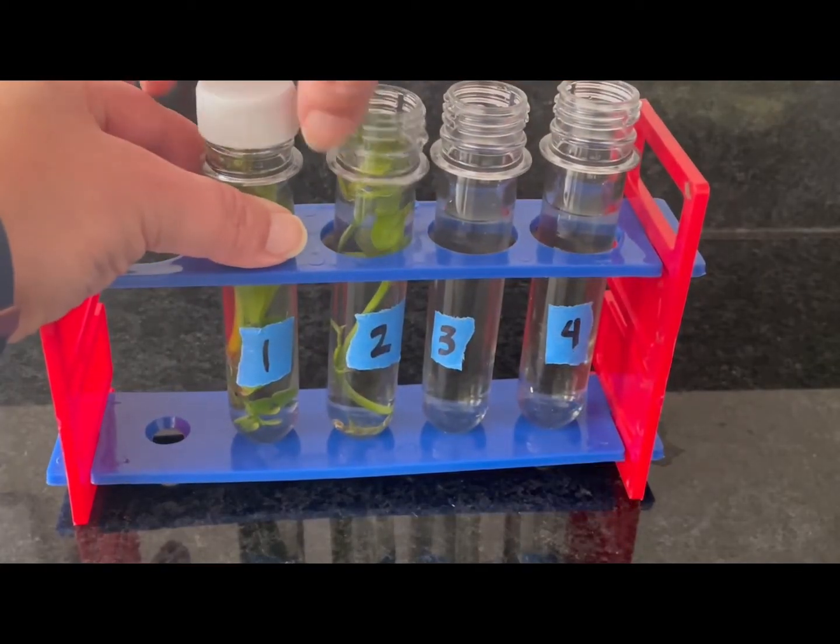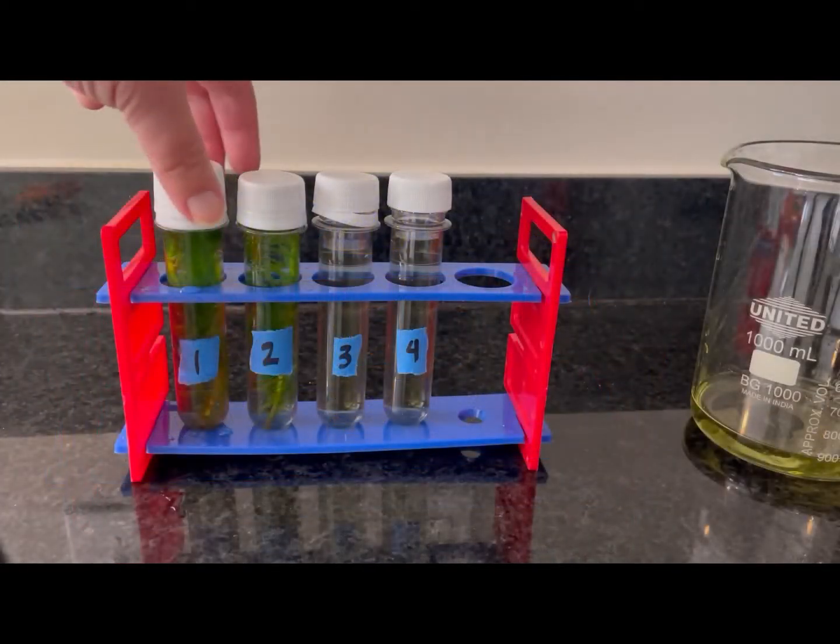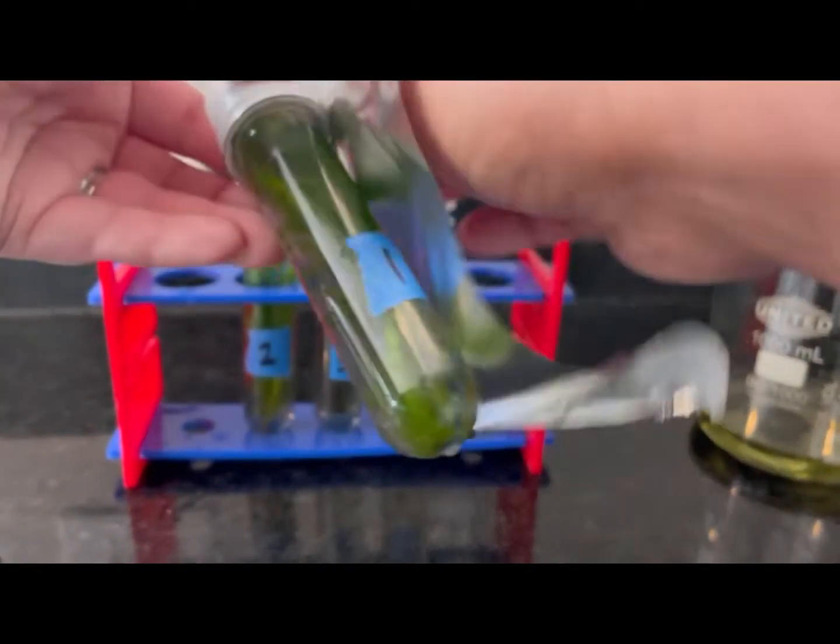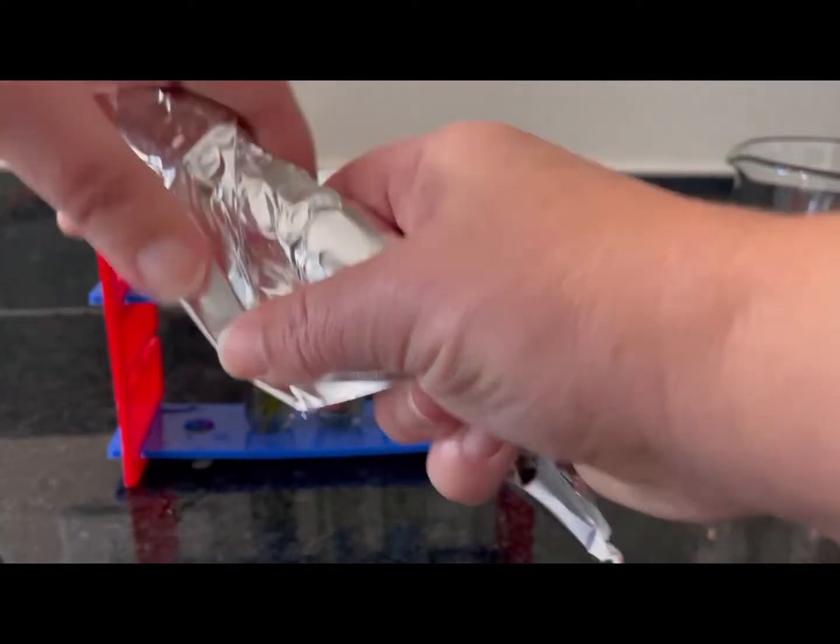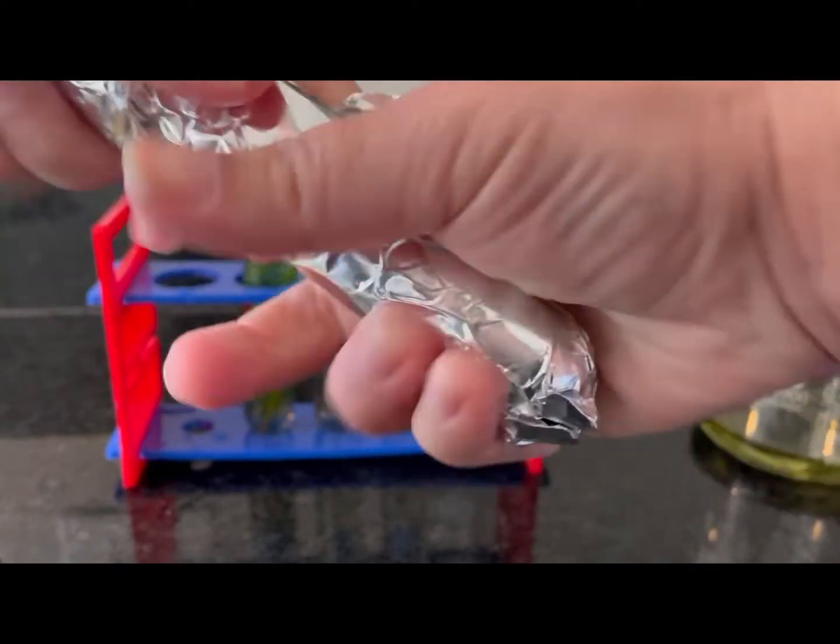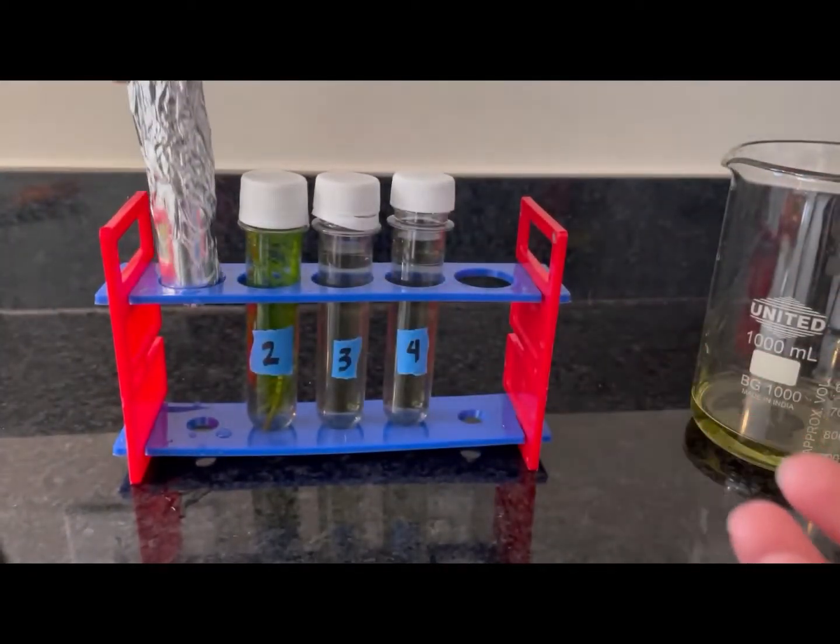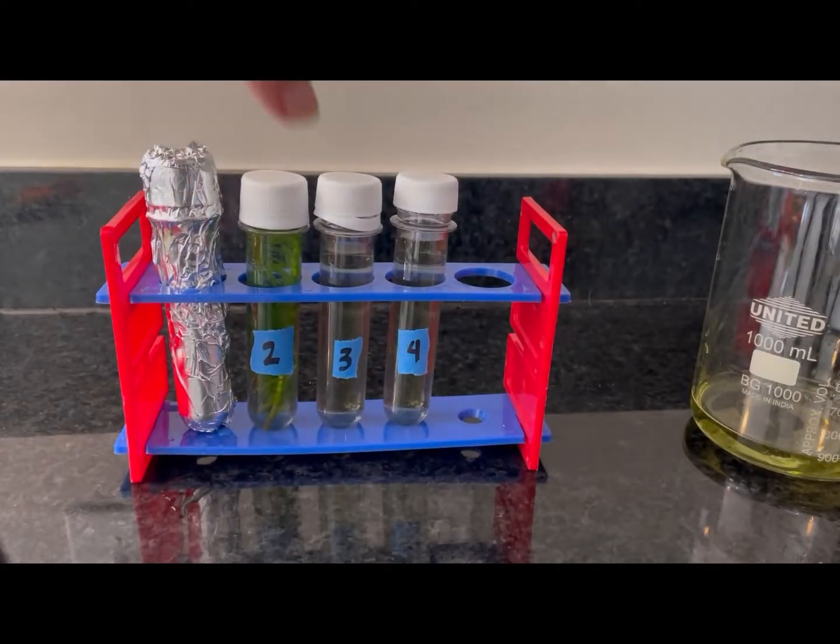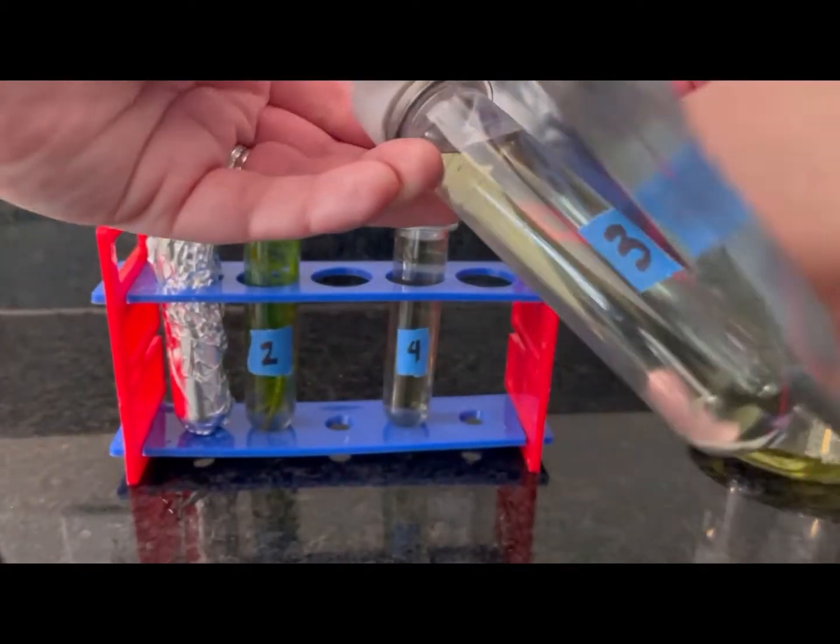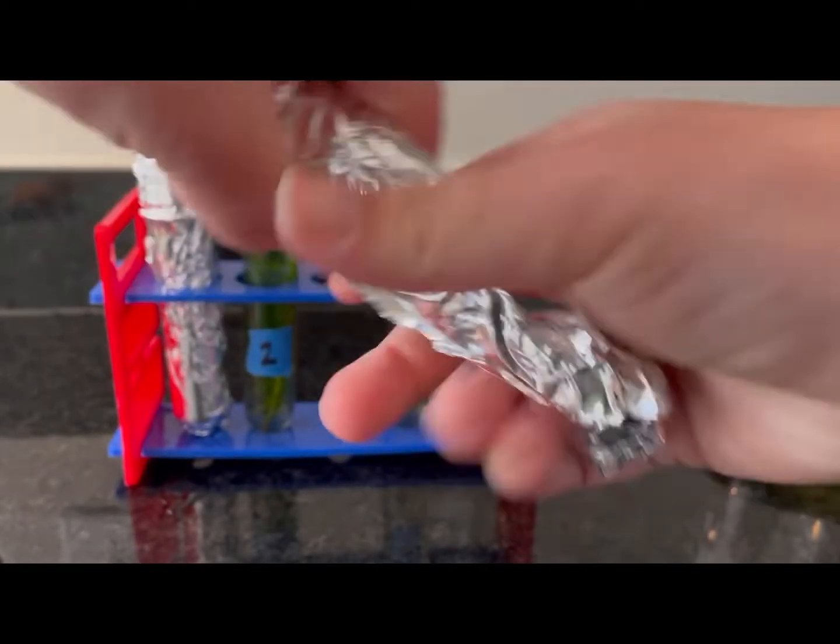Then you'll cap all four test tubes so that we're not exchanging air. Cover test tube number one with foil completely, and you'll do the same with test tube number three. So we have one in the dark with a plant and one in the dark without a plant.